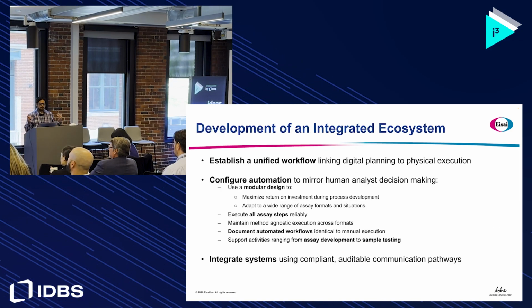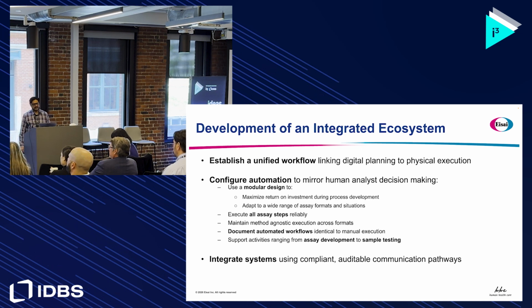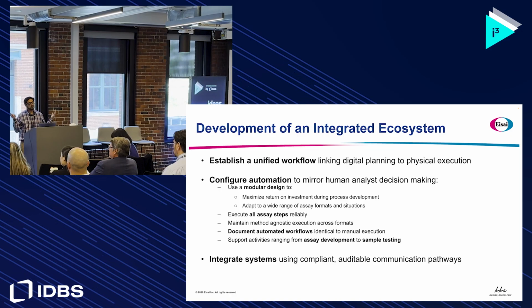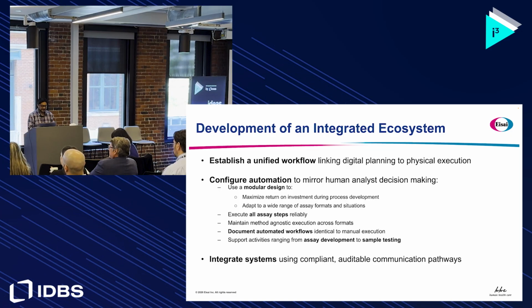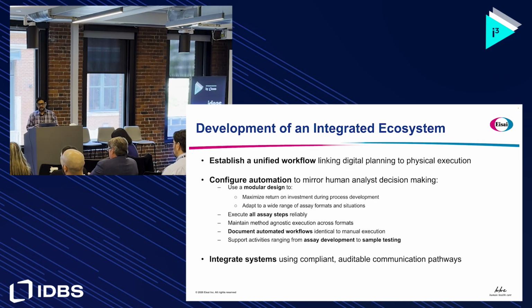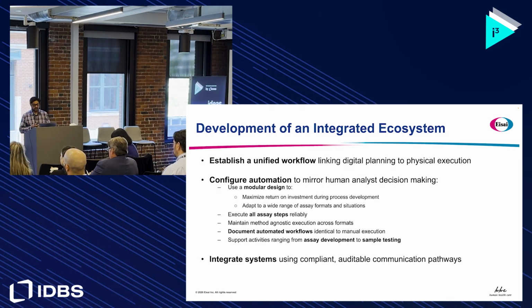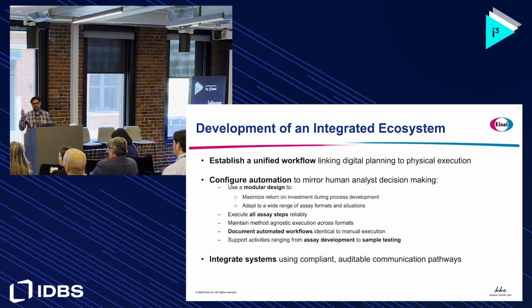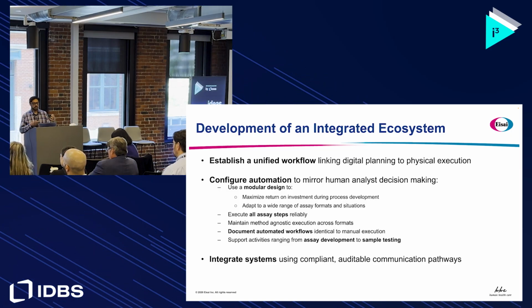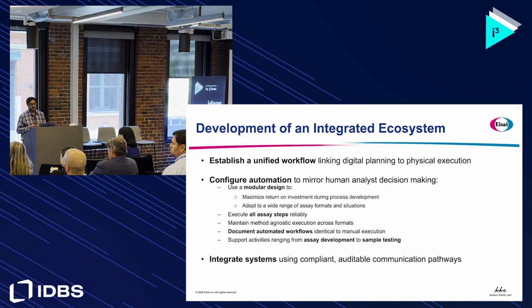So even if you use technology, you still have roadblocks. So we took a step back, and we have E-Workbook, we have a robot, we have all this equipment, but they're all kind of isolated. What if we build a unified workflow that ties everything together? We have an automation system that can accommodate all these, and we could even do this manually, or part of it manually in a hybrid approach, and part of it automated. We want to be flexible for anything that is thrown at us.